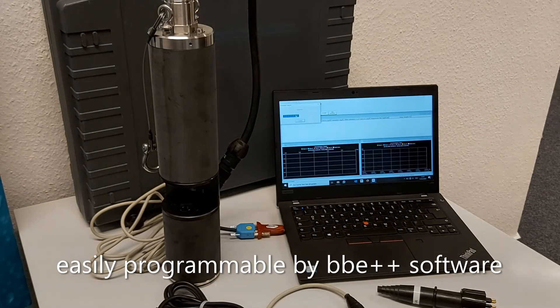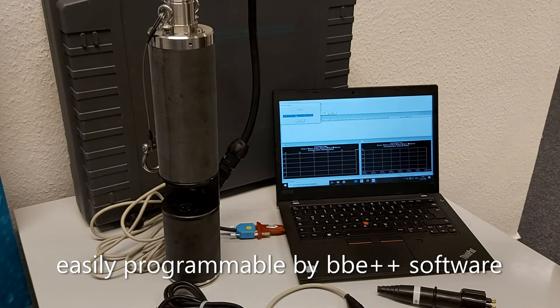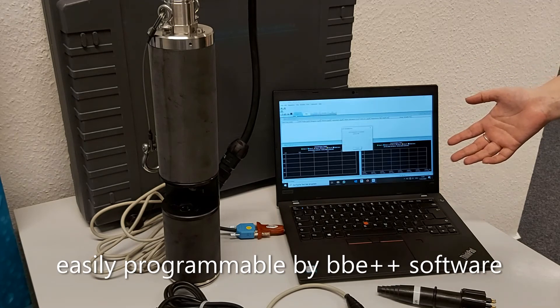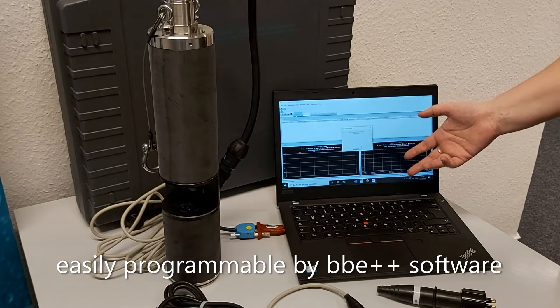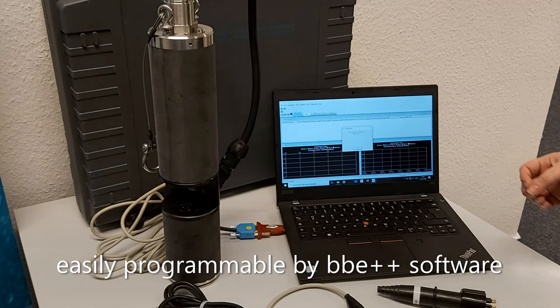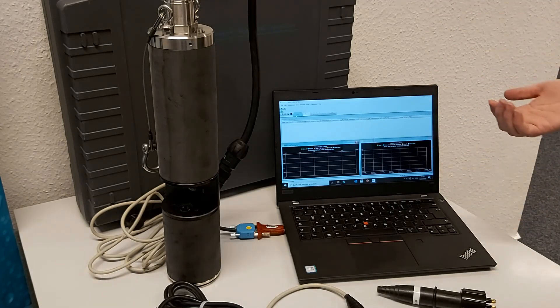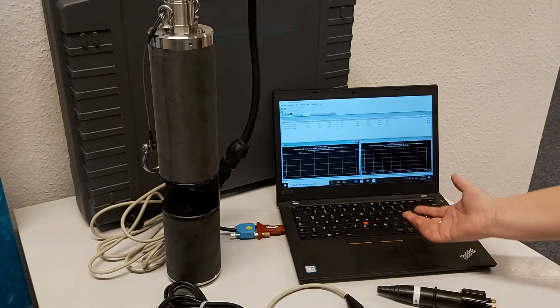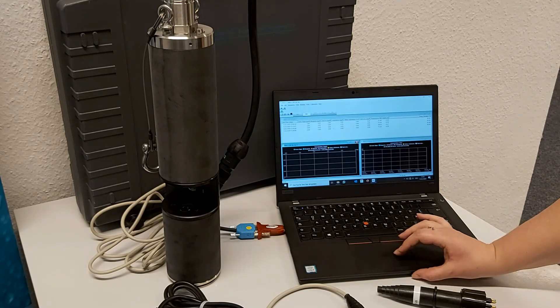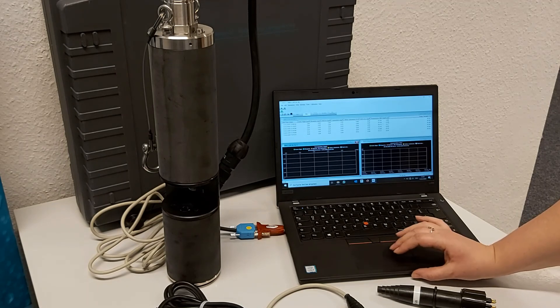I've connected the FluoroProbe to the computer and we're going to show an example of how the instrument collects data and what that looks like in the software. Right now the instrument is connecting to the computer and it's warming up the different LEDs that are going to be used to excite the algal pigments. Once this is done — our probe is not currently in water, so it's not measuring any algae — we will start to see it collect data. Here we can already see some data coming in, and since it's not in the water, it's measuring no algae and none of any of the different algal classes, but we are getting measurements of depth and transmission as well as sample temperature.